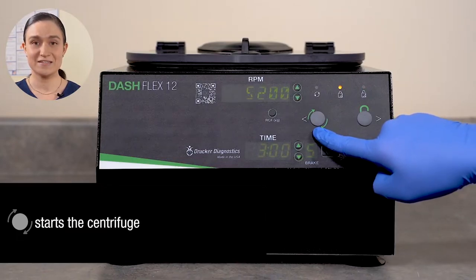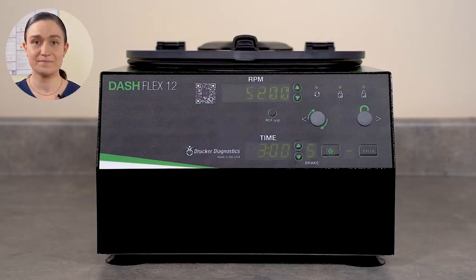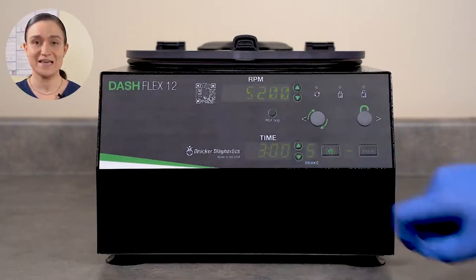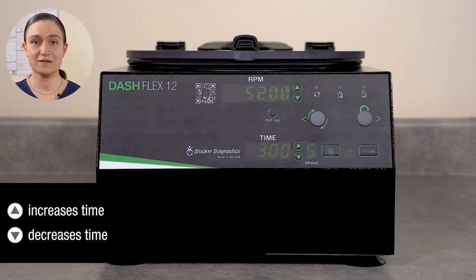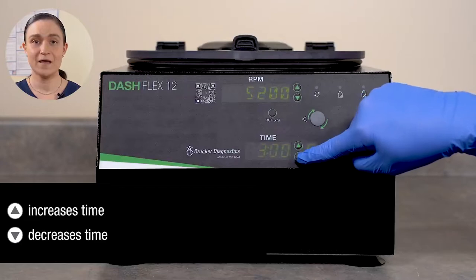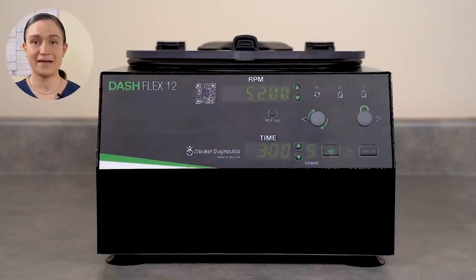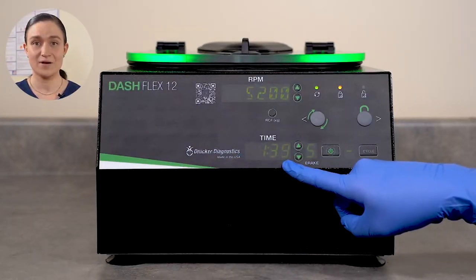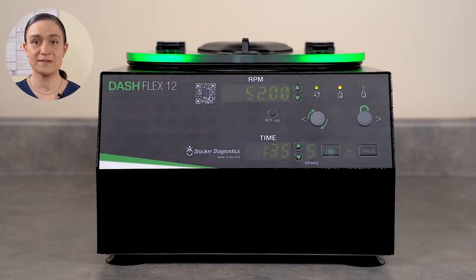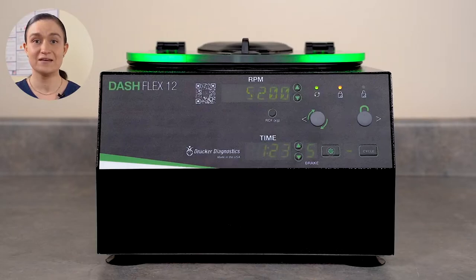The Start button starts the centrifuge. When you press Start, the Dash Flex 12 will run whatever settings are currently displayed on its screens. The Time display shows the selected time in minutes and seconds. Like RPM, time can be adjusted using the up and down buttons next to it. When you start your centrifuge, the time screen becomes a countdown timer showing how much time remains. Your centrifuge will spin for a little while before the timer starts counting down, because the countdown doesn't start until your centrifuge is up to speed — that way your tubes get spun at the appropriate speed for the appropriate time.